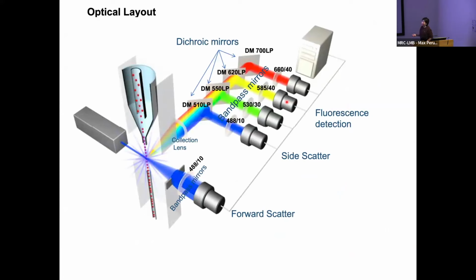So let's summarize what we talked about previously onto this simple diagram. When your cells, your samples, are injected into a nozzle or fluidic system, they are being forced into a single file, one cell passing through this sensing point at any one time. The emission lights from probably multiple fluorophores are collected by this lens and enter the optical path.